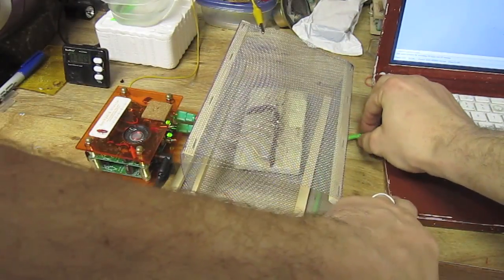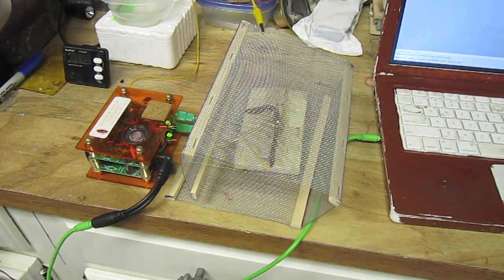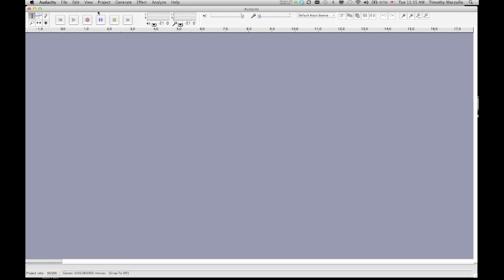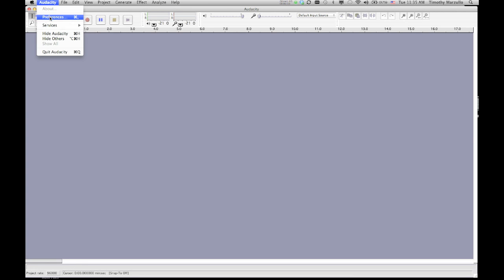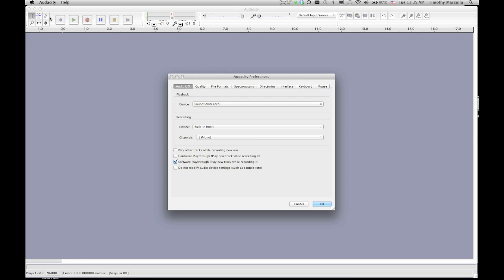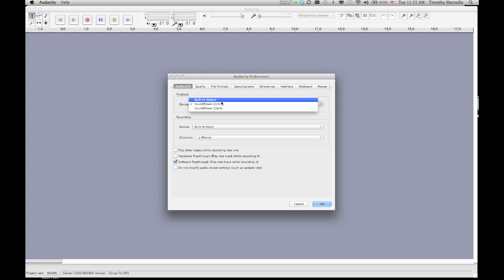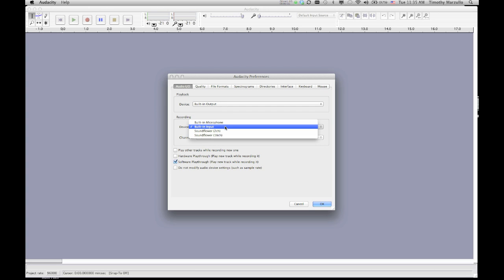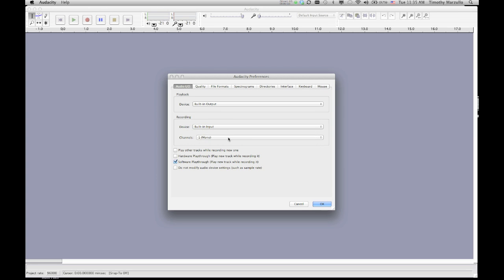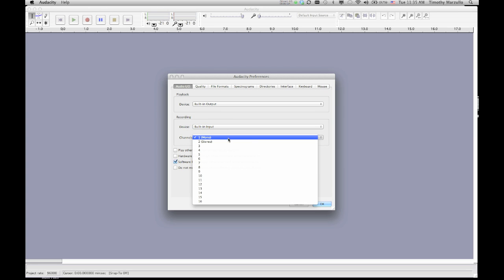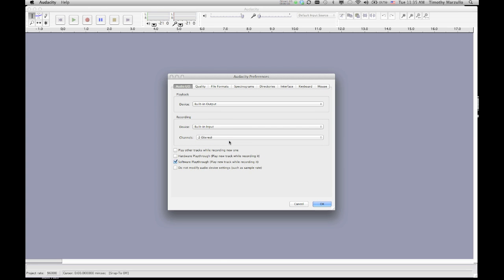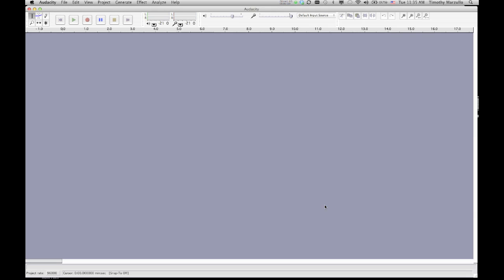Once we have this, we plug the two-channel spiker box into our laptop and fire up Audacity. Open up the preferences, select Audio I.O., and in the device output, select Built-in Output. On the device recording input, select Built-in Input or Line In, and make sure to select two channels, that is stereo mode. Also, select Hardware and Software Playthrough so you can hear what you are recording.